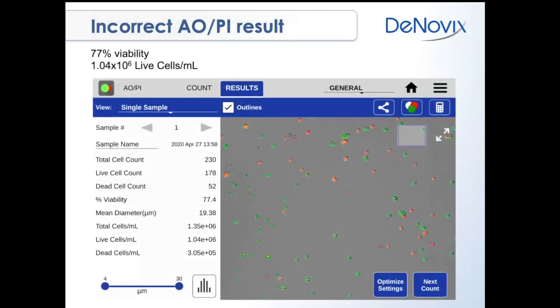So it's very important, especially for trypan blue, but in both techniques, to just take a look real quick at the focus and the exposure. Don't trust that it's been set correctly by the previous person, and adjust if needed to get the most accurate counts.